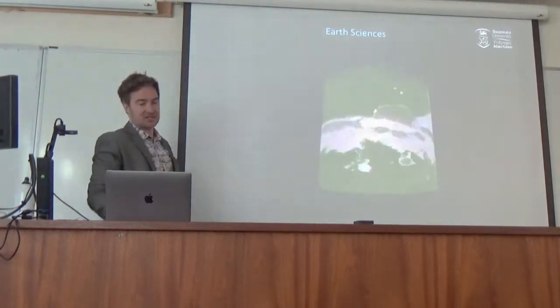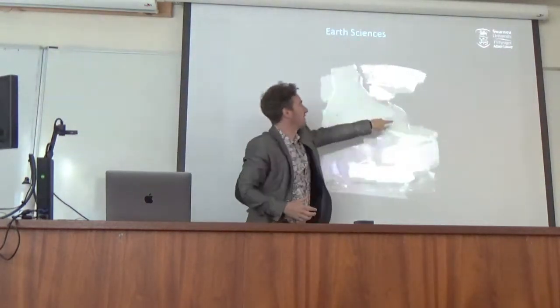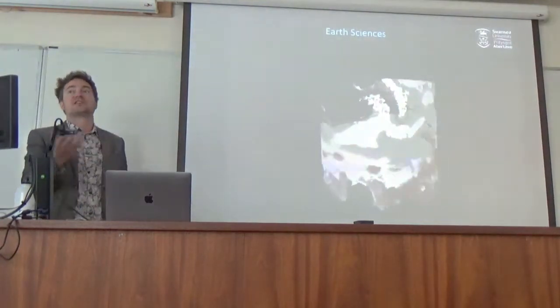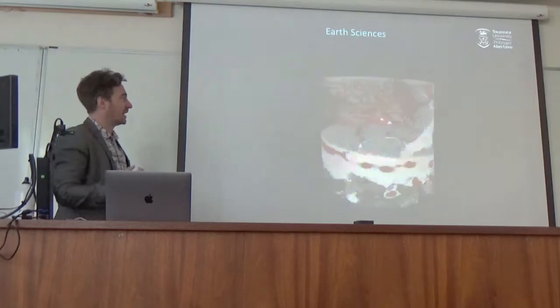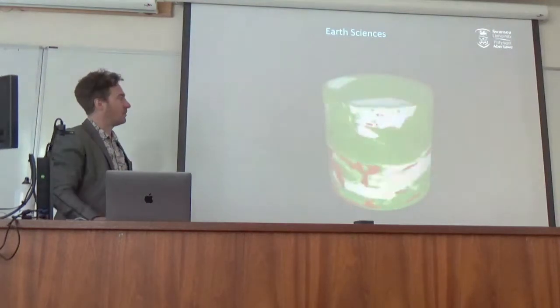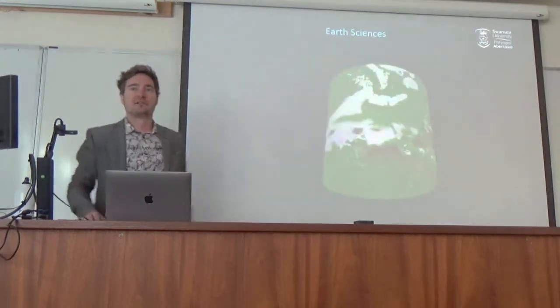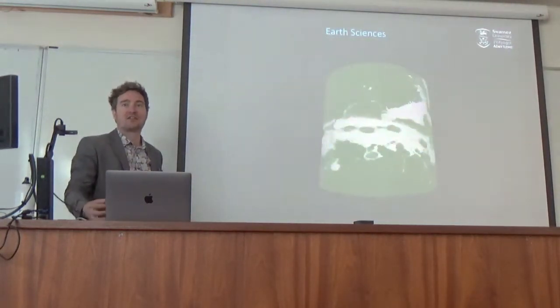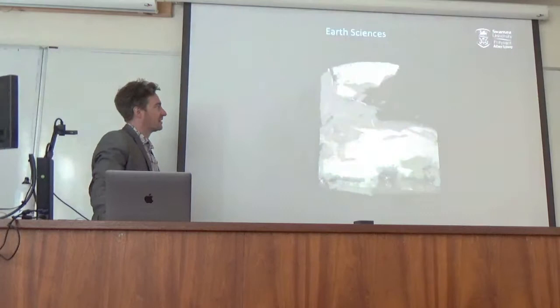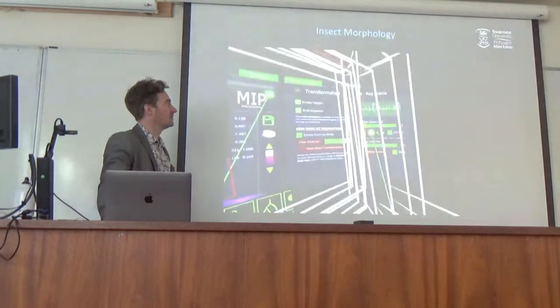But also, we've just put a grant proposal in with someone in New Zealand on this, where this actually is the feature of interest. When they saw this, they'd never seen that before. So this imaging enabled that, but not just the imaging, the visualization actually was the thing that enabled that collaboration. And these are little air pockets as well, which they'd never really seen in 2D cuts through the core. So this indicates potential earthquake events, which are really important in New Zealand to try and understand, and their effects on the kind of dormant earth structures. So that's what this is potentially related to, an earthquake event after deposition.